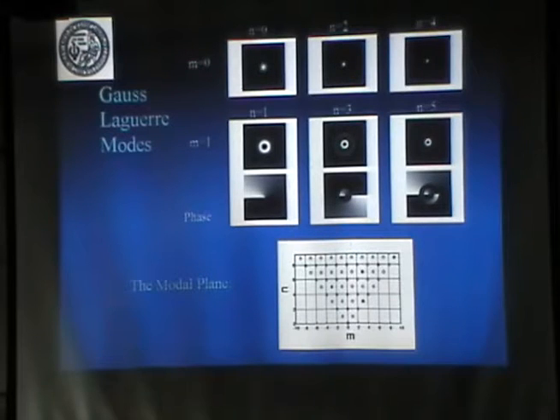For any beam, you have a different set of coefficients. And it's a graphical representation of any beam. In terms of the Gaussian modes, for those that know the Fourier domain, in the Fourier domain we represent things with sinusoids, here we represent things with Gaussian functions.